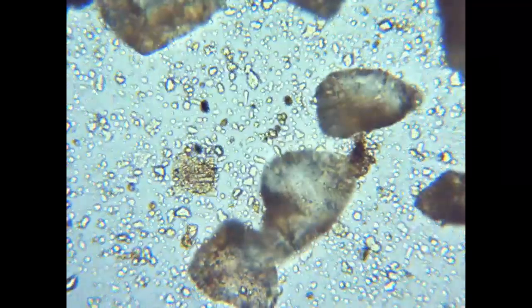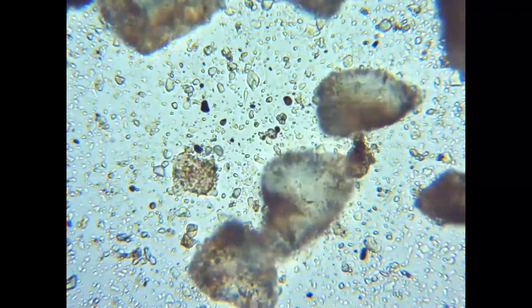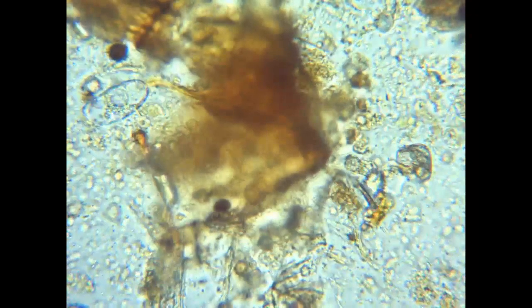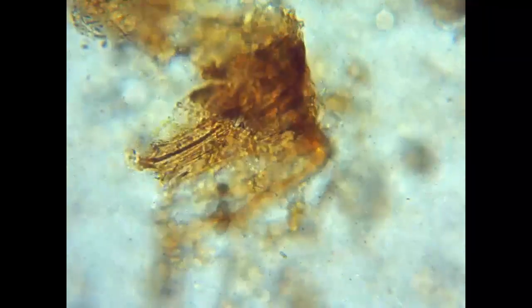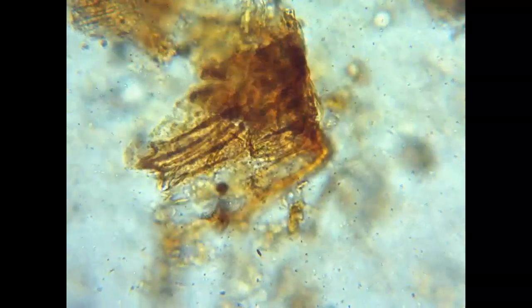On the bad side, you're looking out for root-eating nematodes, and also too many ciliates. You can have one or two ciliates per slide and that's not so bad, but when you start seeing dozens, you know you're having problems in your soil — most likely anaerobic conditions.